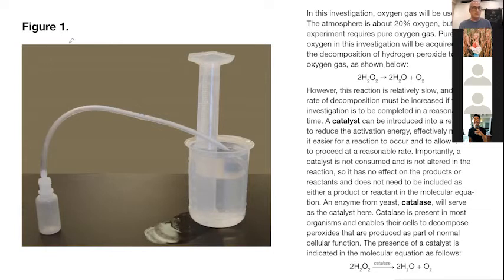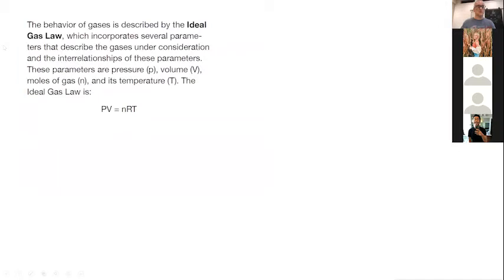So what does that mean? Two of what to 1 of what? 2 hydrogen peroxides to 1 oxygen gas. Right. So when you add different amounts of hydrogen peroxide, you're going to need to determine the moles of hydrogen peroxide that are present, and then half of that number will be moles of oxygen gas. Okay, so that's how we're going to determine how many moles of oxygen gas we have.